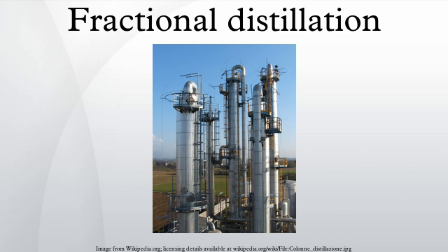Normal laboratory fractionation columns will be simple glass tubes filled with a packing, often small glass helices of 4 to 7 mm diameter. Such a column can be calibrated by the distillation of a known mixture system to quantify the column in terms of number of theoretical trays. To improve fractionation, the apparatus is set up to return condensate to the column by the use of some sort of reflux splitter. A typical careful fractionation would employ a reflux ratio of around 4:1.